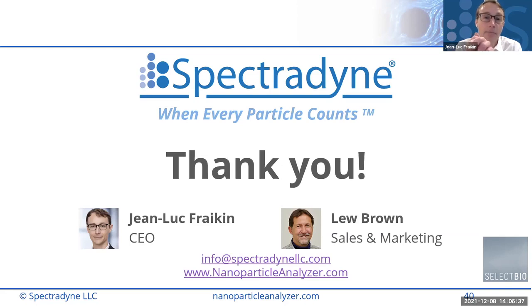That's a good question. The surfactants that we have tested so far include tween, but also a poloxamer, and we can give specifics for that. It's another non-ionic surfactant. And if either of those are too much of a concern, it is possible to use some inert protein like BSA, for example, as a diluent that serves as a wetting agent. There are papers we can send you that talk about how tween is safe for EVs at least, and things like that. But it's up to you to feel comfortable, obviously.